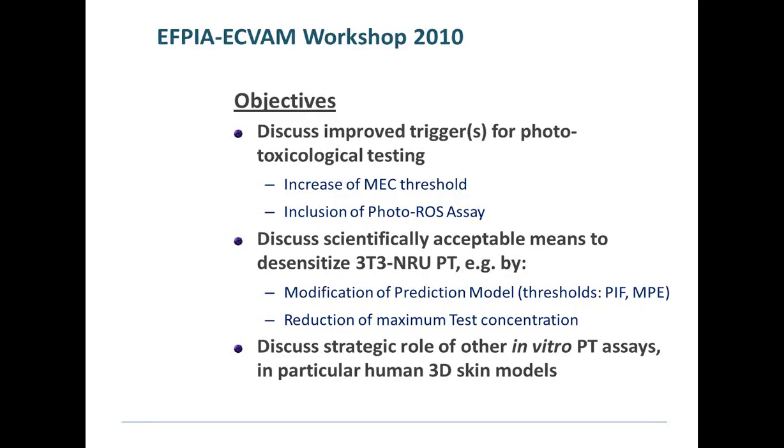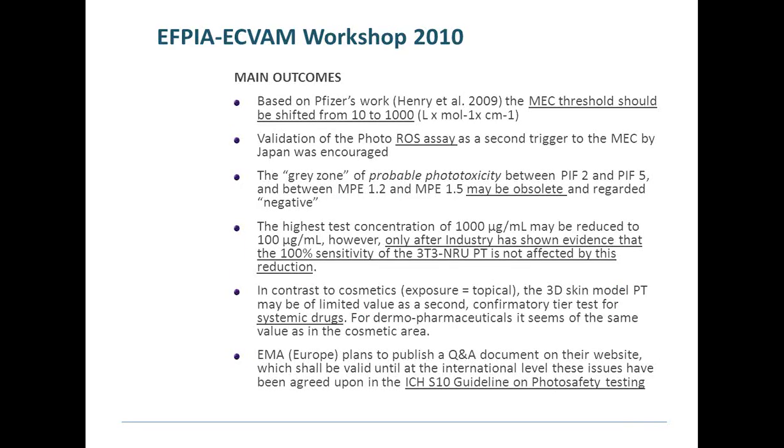The second important point was to discuss scientifically acceptable means to desensitize the 3T3 assay, either by modification of the prediction model or by reduction of the maximum test concentration. The third objective was to discuss the role of other in vitro assays, in particular human 3D skin models, in phototoxicity testing.